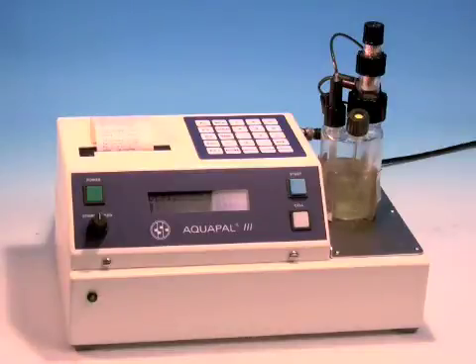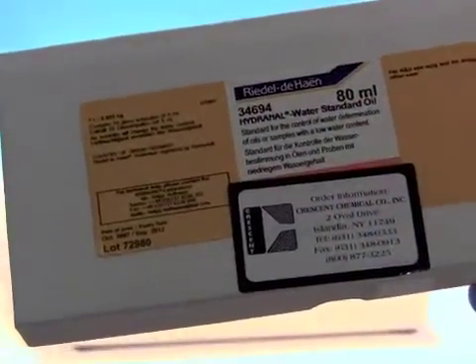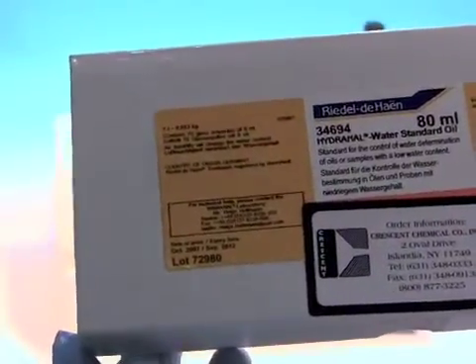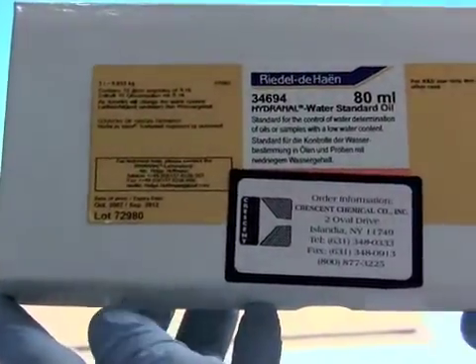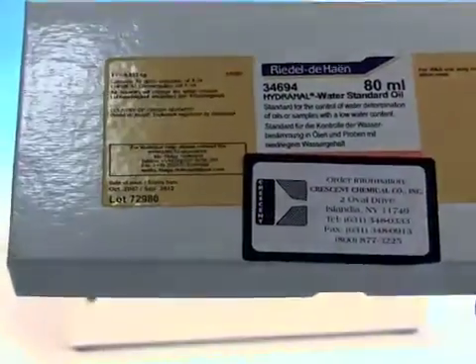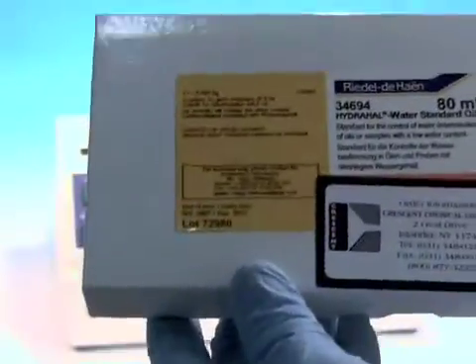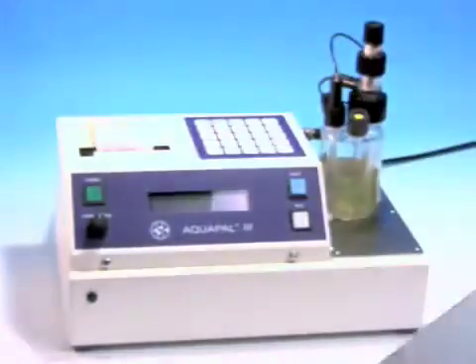For this particular water standard oil, this is it, the Hydranal water standard oil, what they're telling us is that on a coulometric unit with direct injection they were able to get 6 ppm and they estimate about 1 ppm variability that you might get. So this is a low-level standard that some people like to use to verify their low readings.